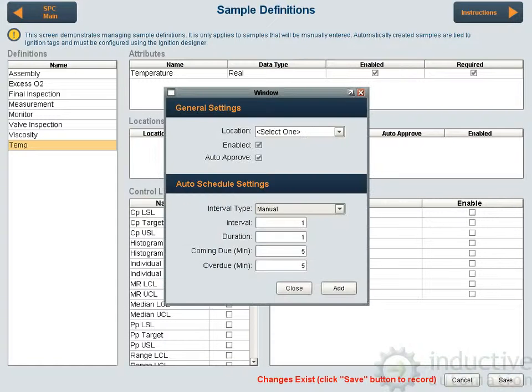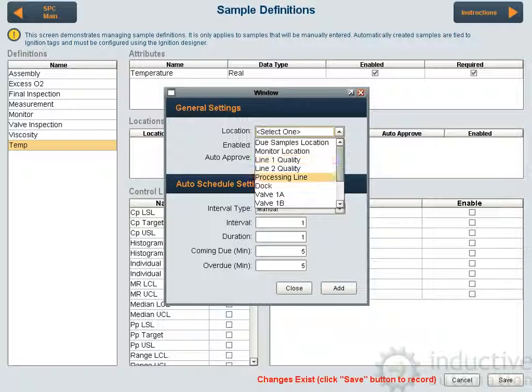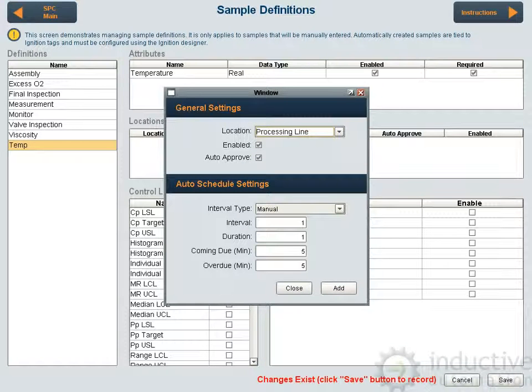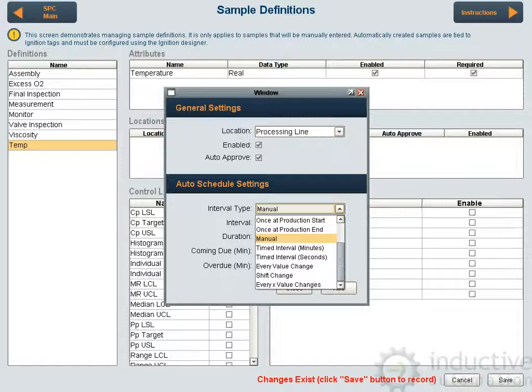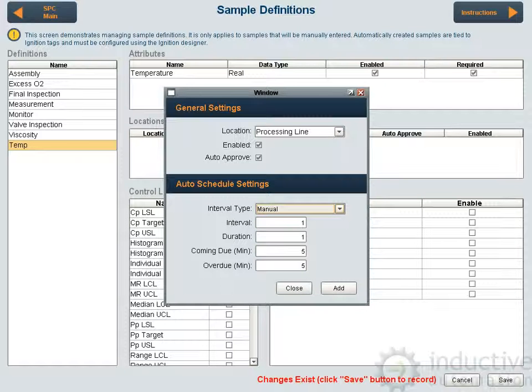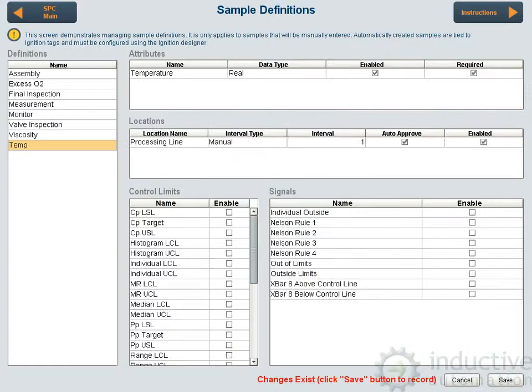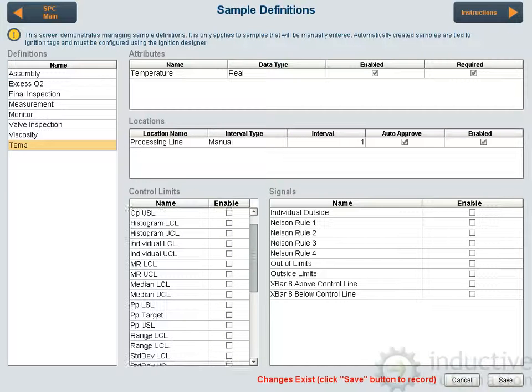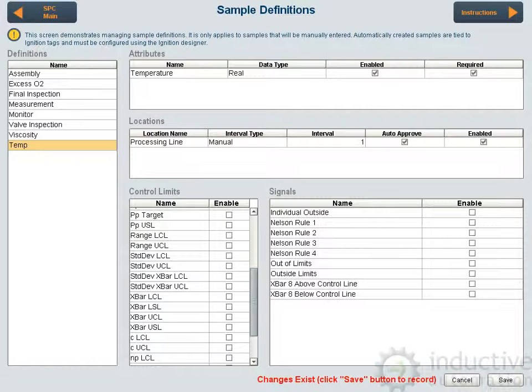Now we want to define the locations where it's appropriate to take this test. I'm going to say the processing line, and again you have whether you want to auto approve. We can automatically schedule samples — we'll get into that more later. I'm going to leave it as manual right now, and because it's manual these values really don't apply. We'll go down and tell it to evaluate the X-bar lower control limit and upper control limit, and we'll take a look at Nelson Rule 3.